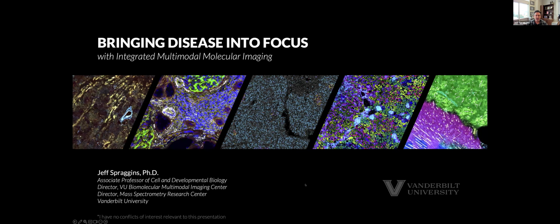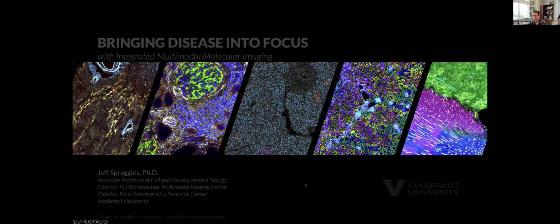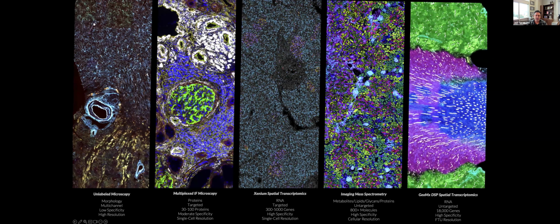When we think about multimodal workflows and molecular imaging, we're really developing tools that allow us to bring together all of the technologies that you see here. All of these approaches are instruments and technologies that we're developing in-house and have here at the Mass Spectrometry Research Center at Vanderbilt University.